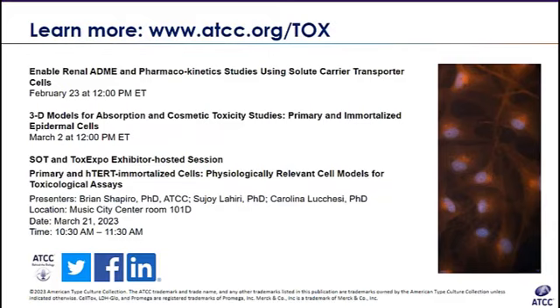I wanted to use that to transition into this next question, which has just come in, about the concentration of cadmium chloride. The asker asks, why such a high concentration of cadmium chloride? Is this physiologically relevant? And what made you choose it?